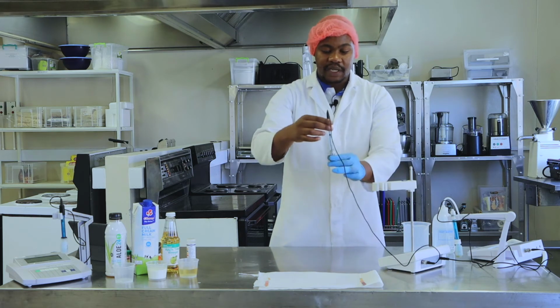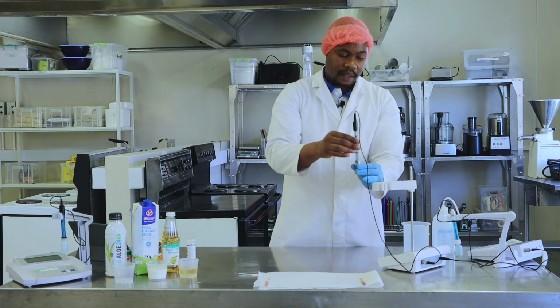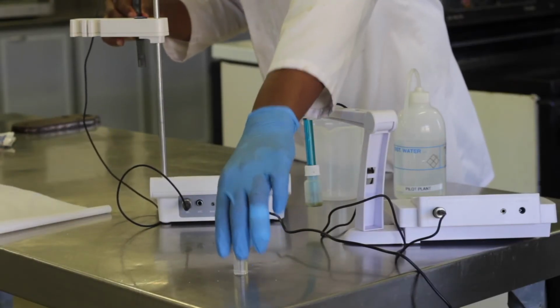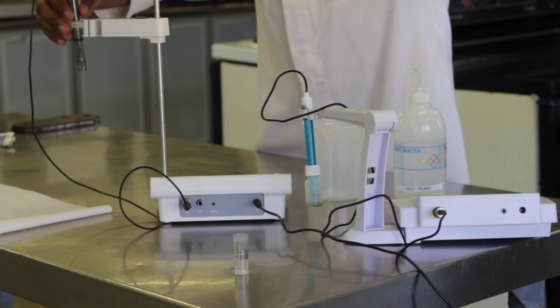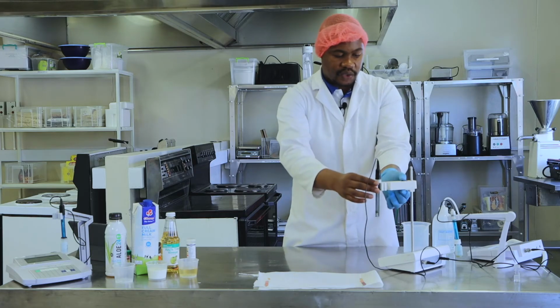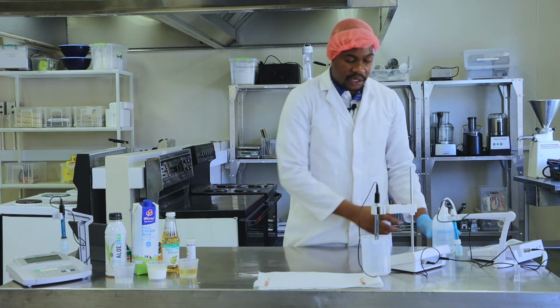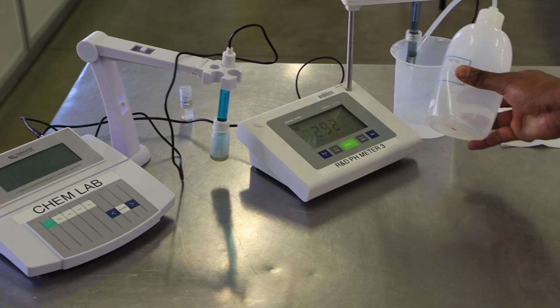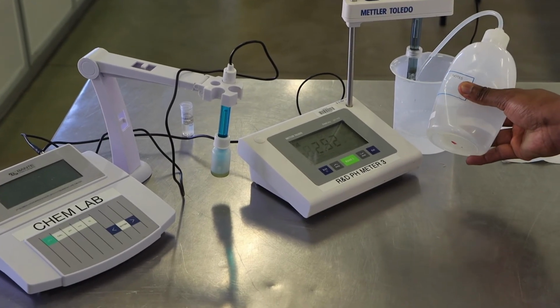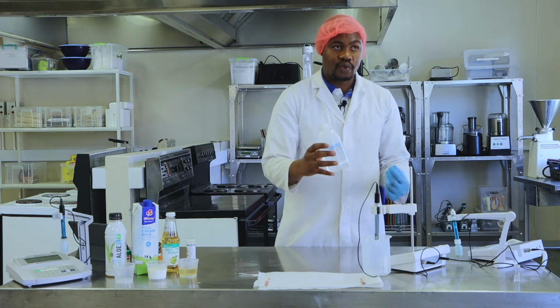So the probe can be taken out, and then if I screw over here, and then put my solution here carefully, and you can still retain your probe here, right? If you want to do it like this, some people normally would put it in like this, and then you basically want to wash your probe here with distilled water. So I'm using distilled water in order to wash here.